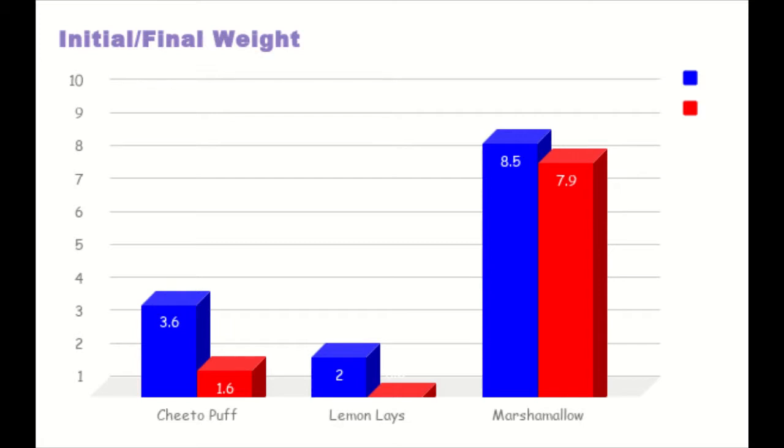The process of burning burned off 2 grams, leaving 1.6 grams and a final temp of 69 degrees Celsius water. Given this information, the energy can be calculated as 2,000 calories or 2 kcal, which represents 1 kcal per gram. Moreover, per serving, in comparison to the given values on the sample nutritional chart, the values are similar but not the same. 6 kcal per serving to 6.15 kcal per serving.